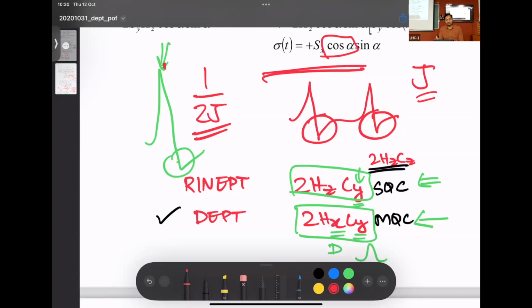And remember, there are other issues that come in. For CH2 and CH3, the tau delay will be different to maximize their sensitivity. So there are other complications. In that aspect, DEPT works very well because during the tau delay, it's a multiple quantum term. So you end up with far fewer phase distortions. Yeah. Good. Any other questions?